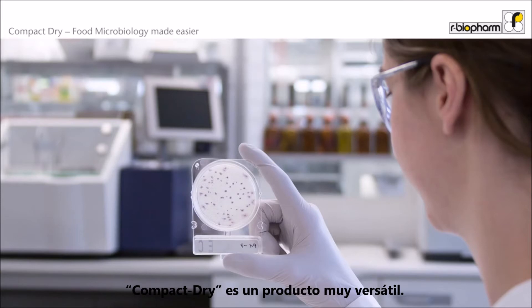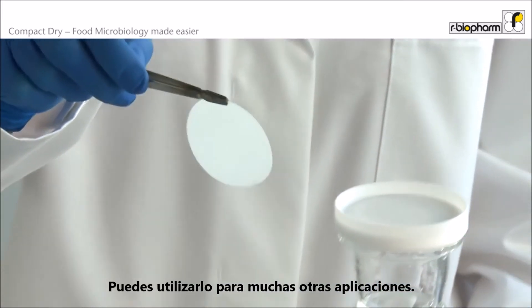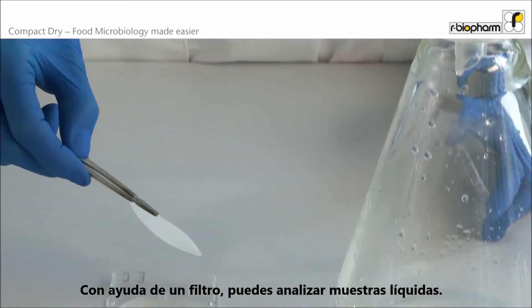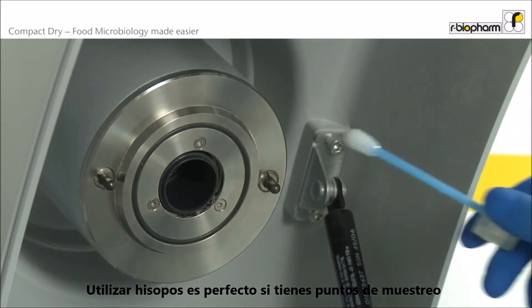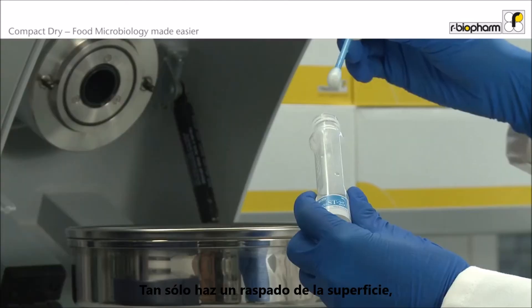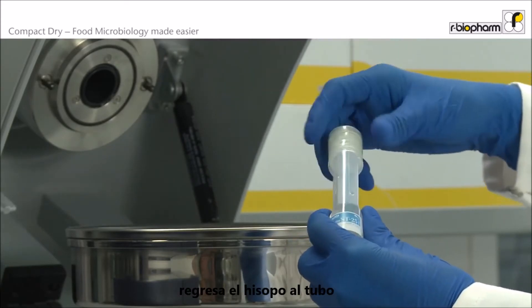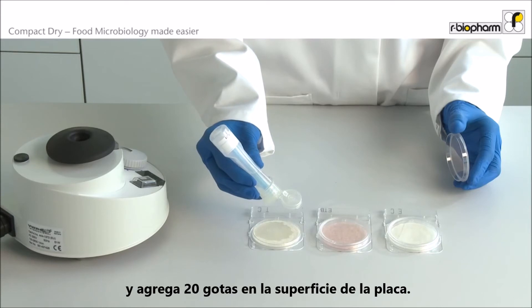Compact Dry is a very versatile product and you can use it for several other applications. With the help of a filter you can test liquid samples. Using swabs is perfect if you have to sample spots that are difficult to reach — just swab a defined surface, put the swab back in the tube and put 20 drops on the surface of a Compact Dry plate.